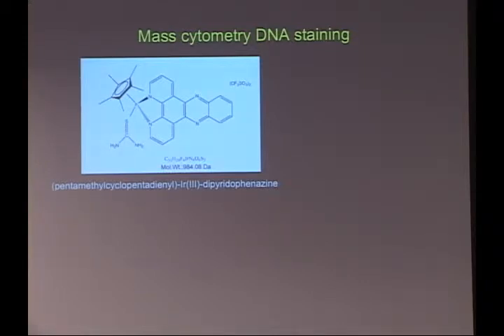A couple problems with this are that it also non-specifically binds to proteins. So if you try and add the intercalator in the presence of the cell staining media, it doesn't bind at all. So it also sort of non-specifically binds to the proteins in the cells. The traditional DNA dyes probably do the same thing. It's just that their fluorescence is different when they're intercalated from when they aren't.